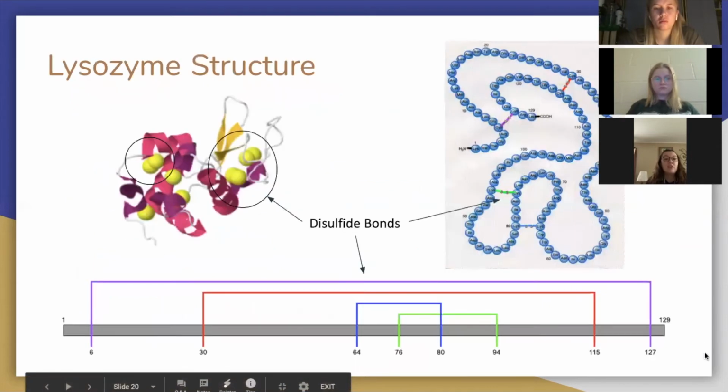In this slide, you will see the disulfide bonds of the lysozyme structure and how they separate to expose the inside of the protein to have the strongest affinity for the column in its reduced state.